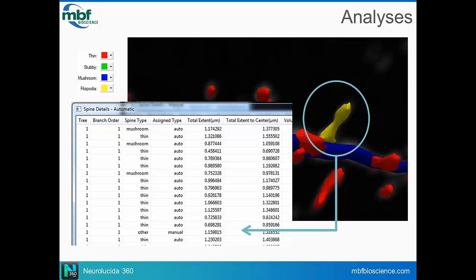Ben has a question relating to montaging images, and I think that this is really important because it used to be very difficult to handle multiple image stacks. But in Neurolucida, we've spent a lot of time creating algorithms that allow you to automatically stitch those stacks in all 3 dimensions. So the XY as well as within Z.